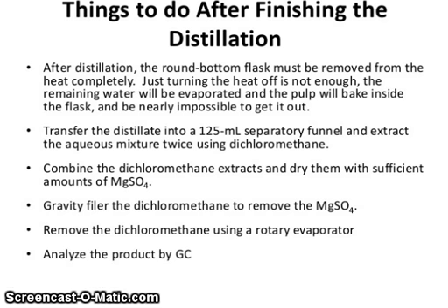Things to do after finishing the distillations. After distillation, the round bottom flask must be removed from the heater completely. Just turning the heat off is not enough. The remaining water will be evaporated and pulp will be baked inside the flask and nearly impossible to get out.